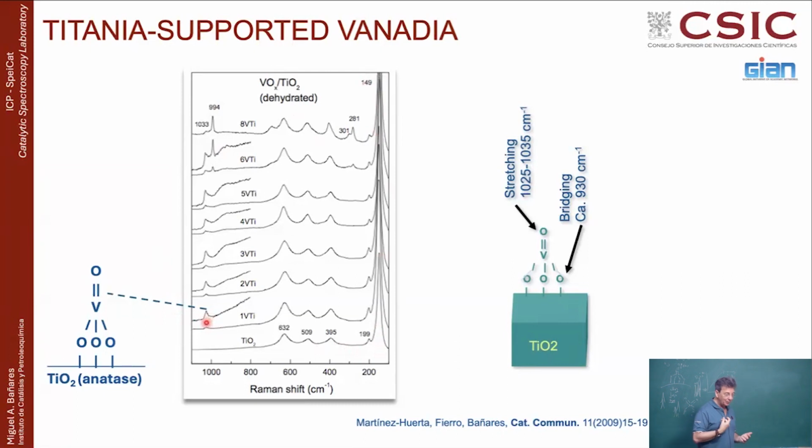You see that. And what do you see? A vibration at about 1000 plus, which is this vanadium mode of the dispersed vanadium oxide on top of the titania anatase support. You increase the coverage, you have more and more vanadium, so this band grows stronger and stronger. And because you have more and more, they start to have neighbors. They start to have vanadium-oxygen-vanadium bonds, and then you see an increase in polymerization. This was isolated. Here you start to see the polymerization, increasingly polymerized. So this is 5 weight % vanadium oxide on titania.